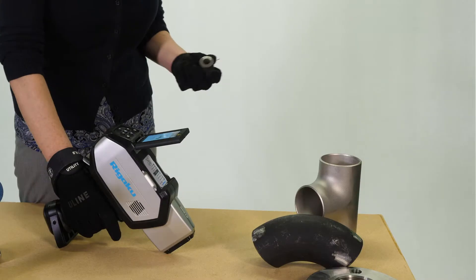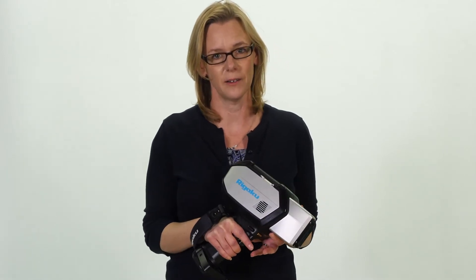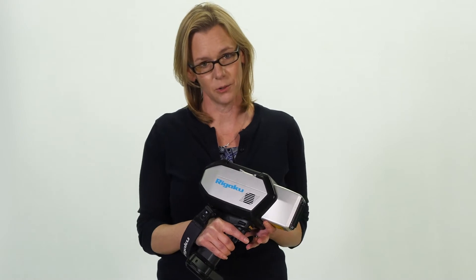Featuring the first carbon-capable high-resolution shell spectrometer known as Hi-Res technology, it's the first of its kind to be miniaturized and integrated into a ruggedized IP54 alloy analyzer made for the environment you work in.